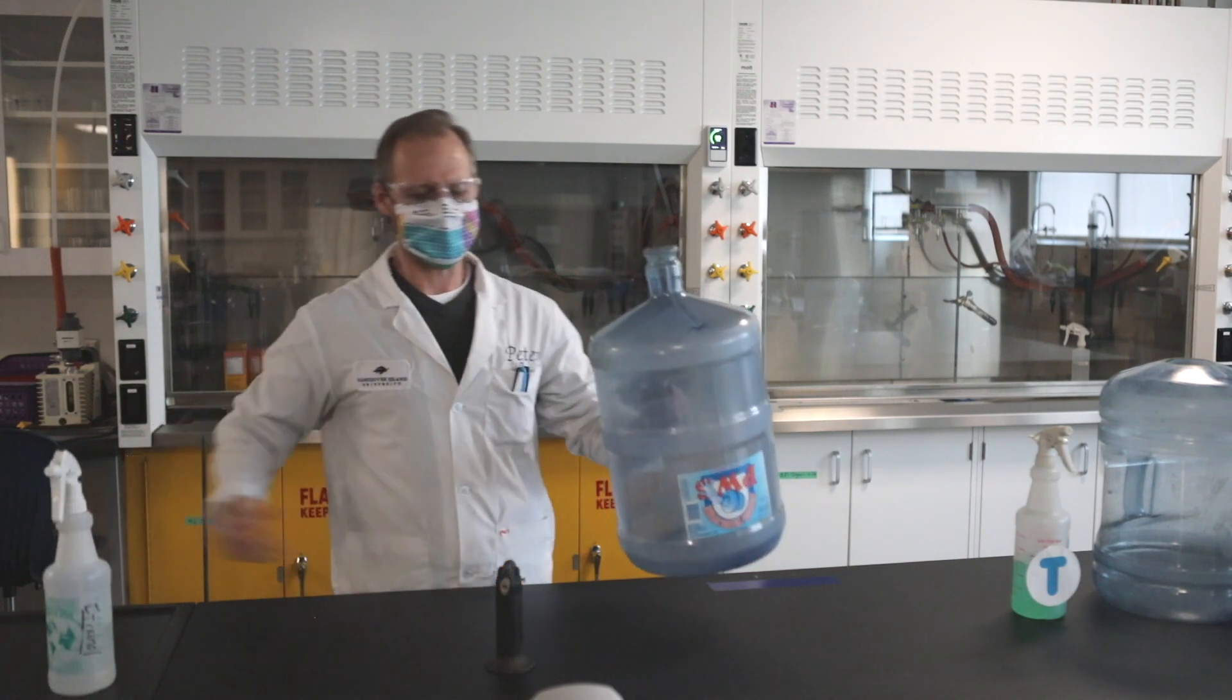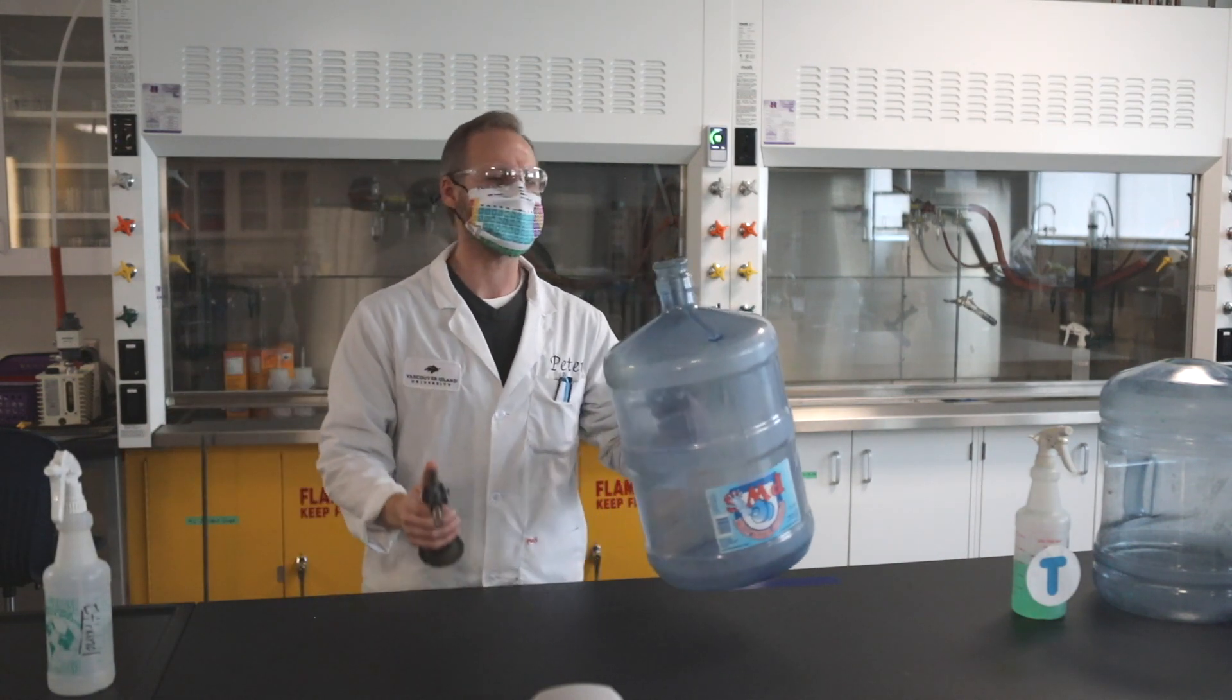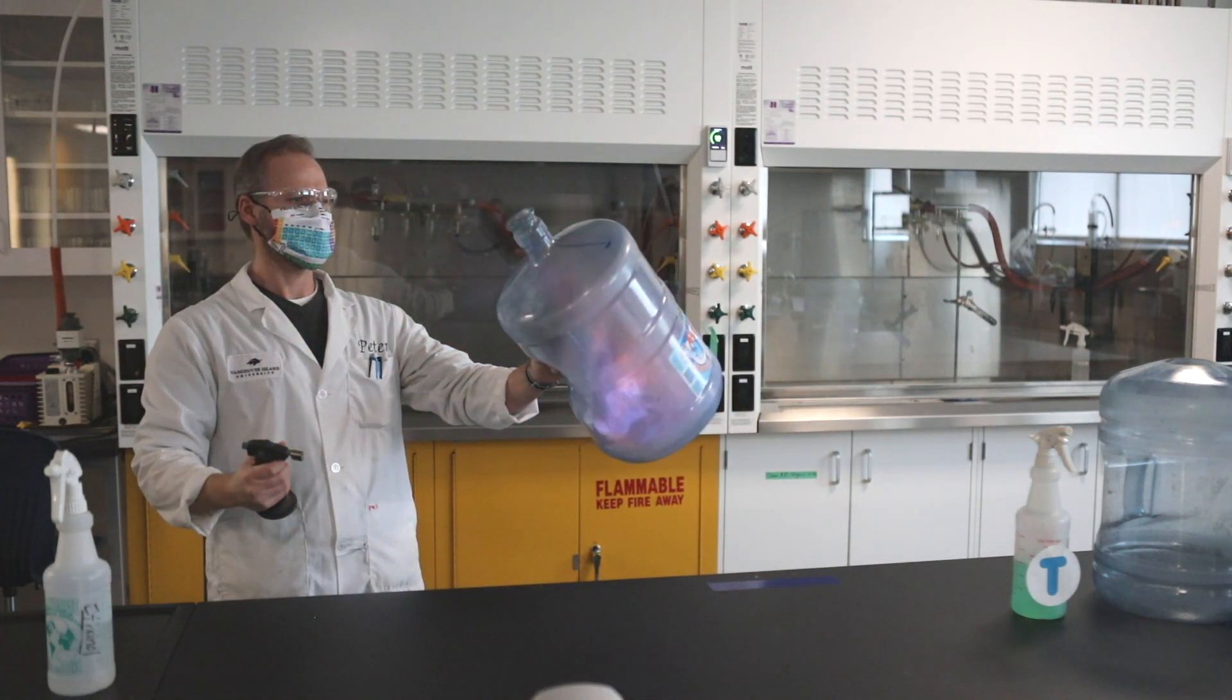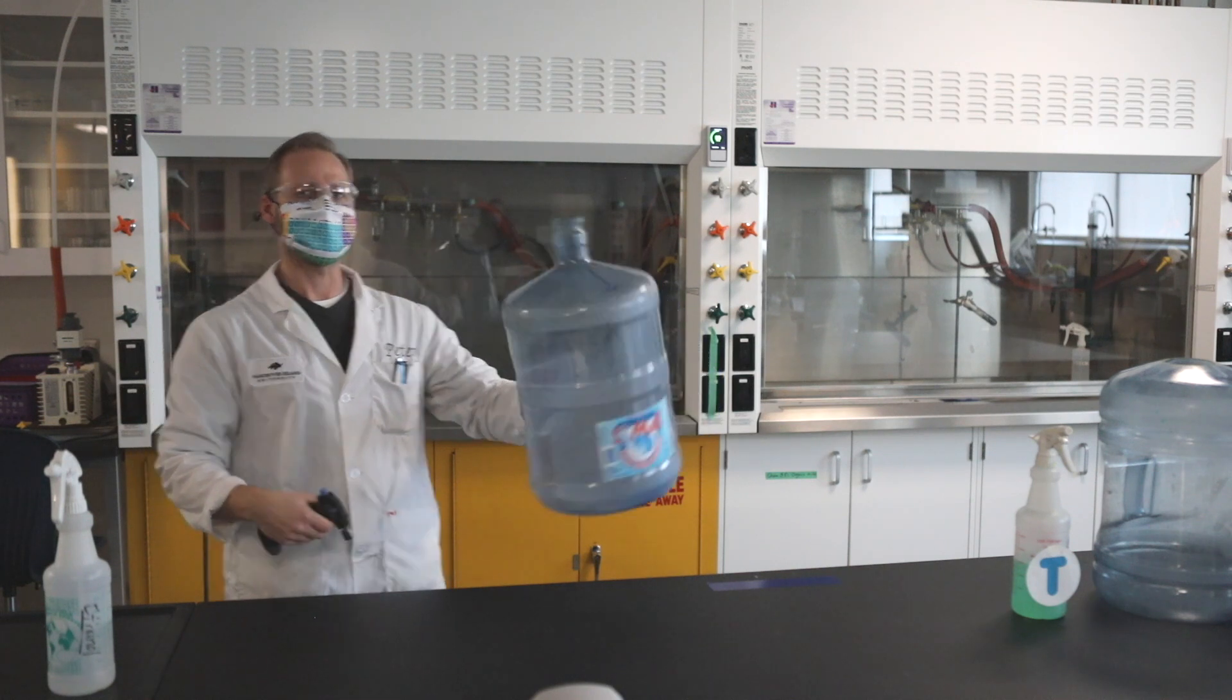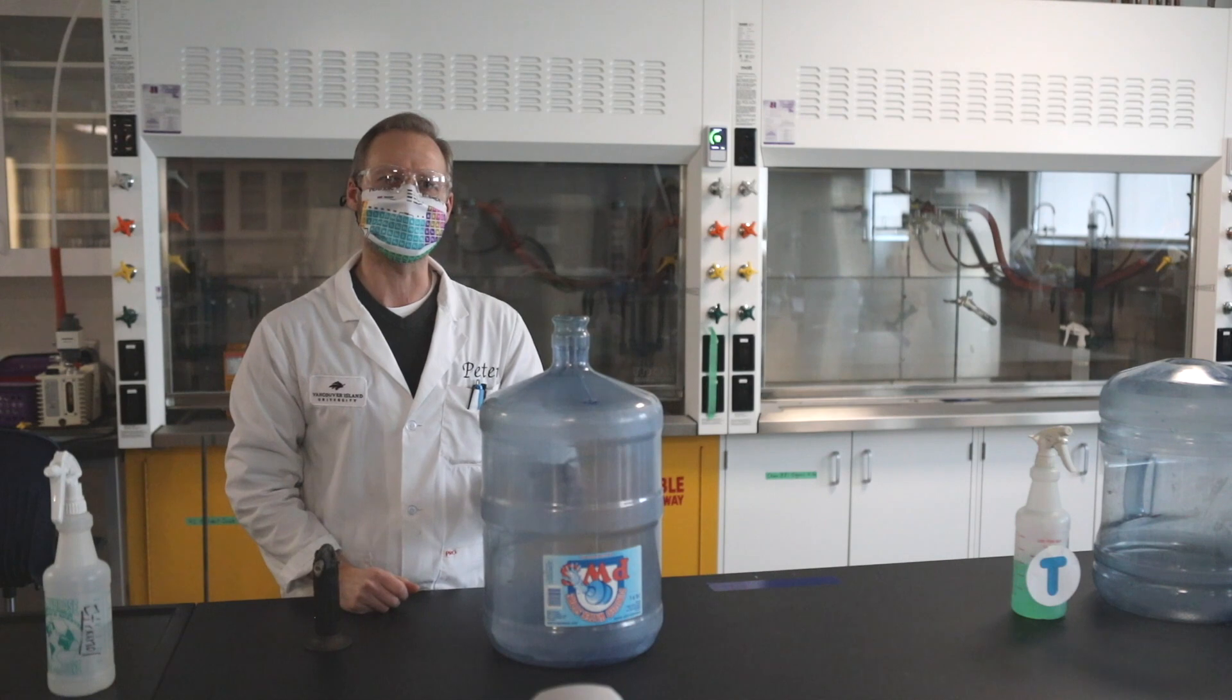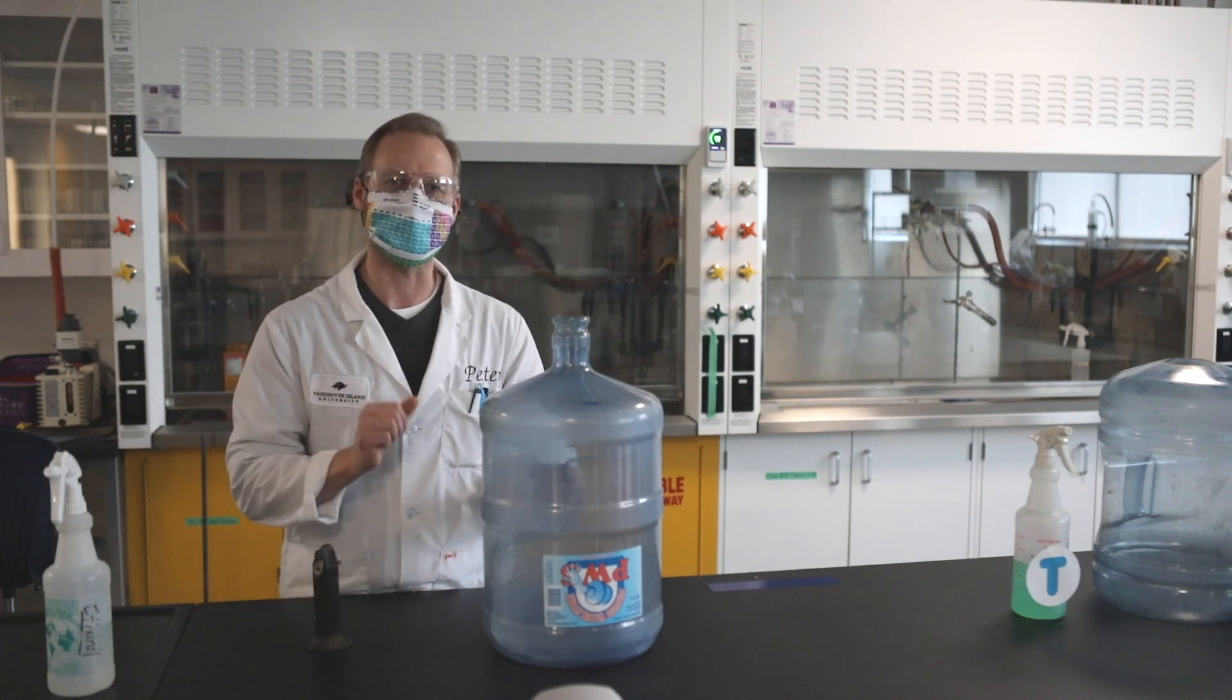Alright, let's light this thing up and we're going to see what the color gives. Just ethanol on its own. Alright, so that's ethanol. Now what we're going to do is we're going to go to the next one. We're going to add a bit of metal to it and see what color that gives.